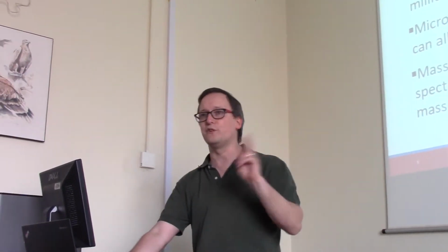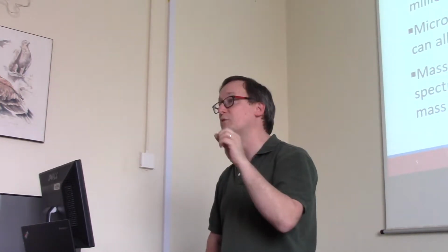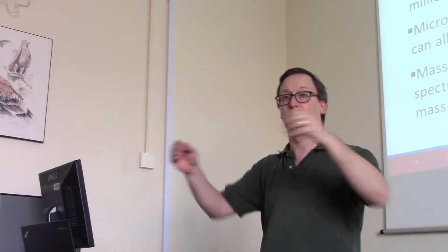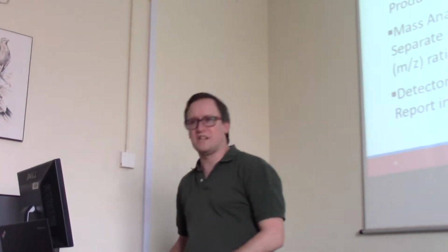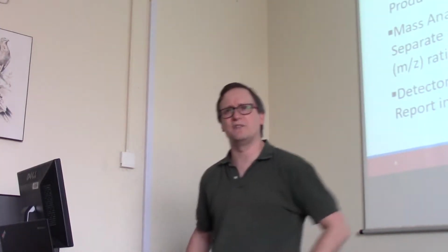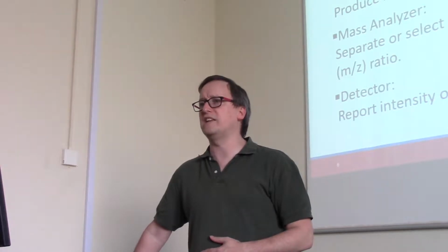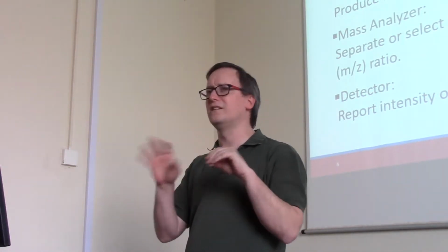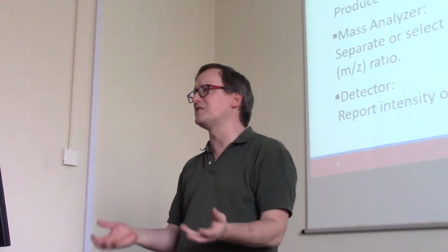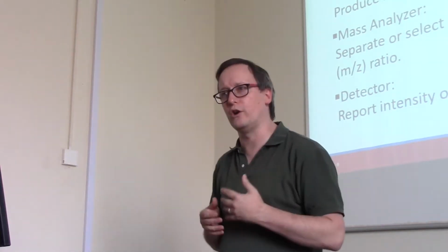So when I say serial versus parallel, I mean serially, I'm going to measure this, and then I'm going to measure that, and then I'm going to measure the other. With parallel measurement, we're measuring lots of things at once. So, what is a mass spectrometer? It's a kind of bewildering thing to ask, frankly. You might go visit the Proteomics laboratory over in the clinical building, for example, and you would see a nice plastic box, about tall off the ground, and it has little lights blinking on it, and you ask the technician, what is this thing doing? And that's great, but internally, you don't have much sense of what's going on.